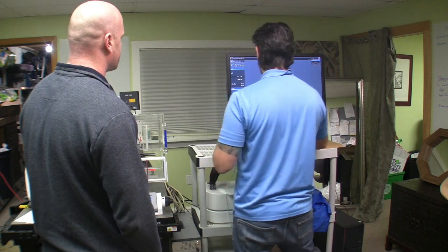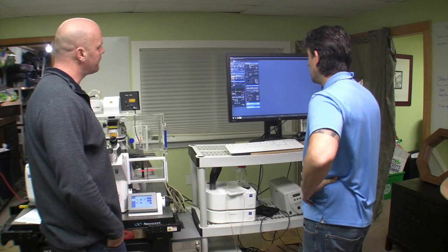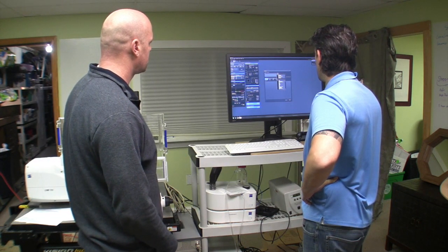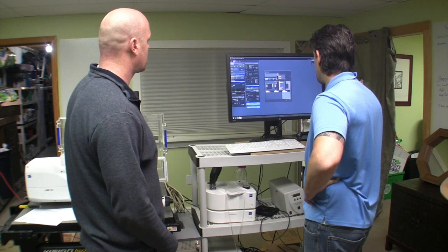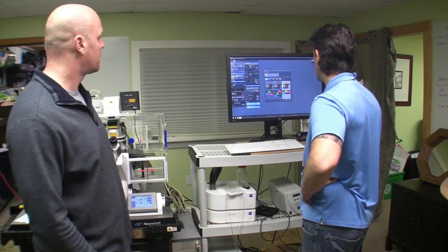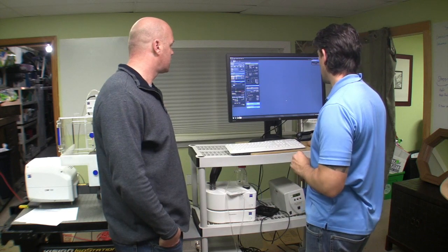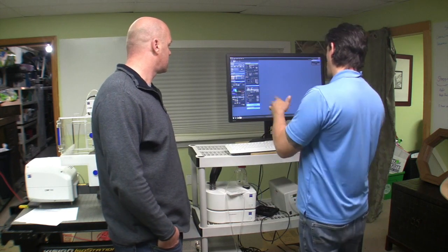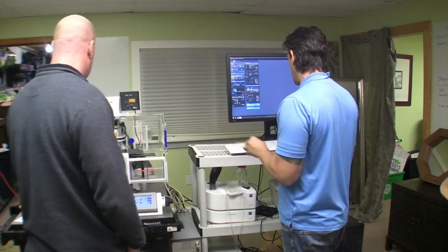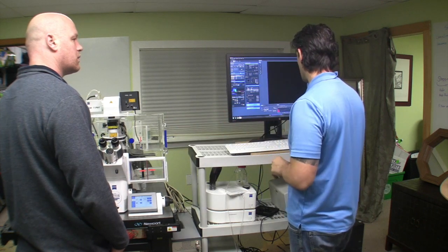Okay, so then here I can go over to the laser scanning part of the system and do a smart setup. So this is just typically how any user would set it up, or the most basic, but with all three channels, just to show that all three detectors are going to take an image. You could do this on one channel, but just capturing the whole thing at once. If all this works, that means that all three internal detector channels work.